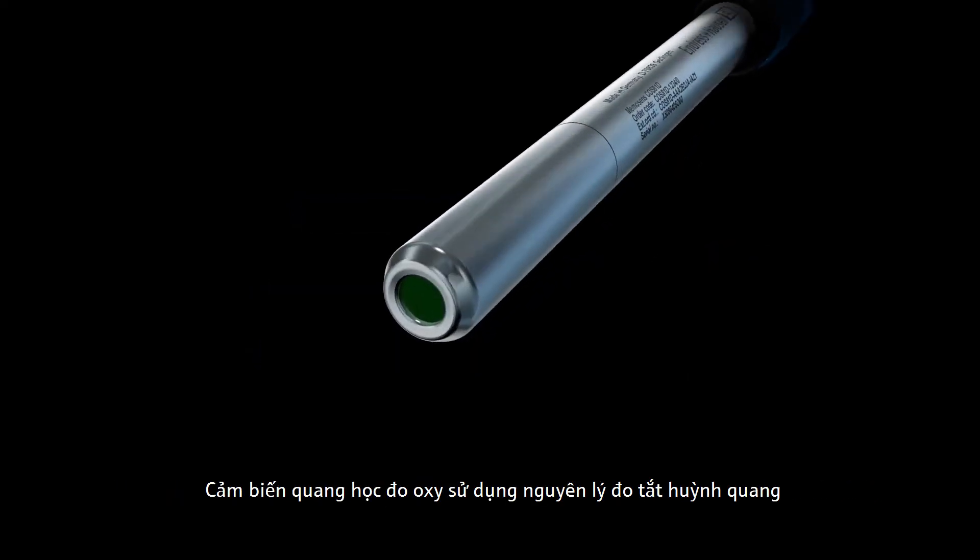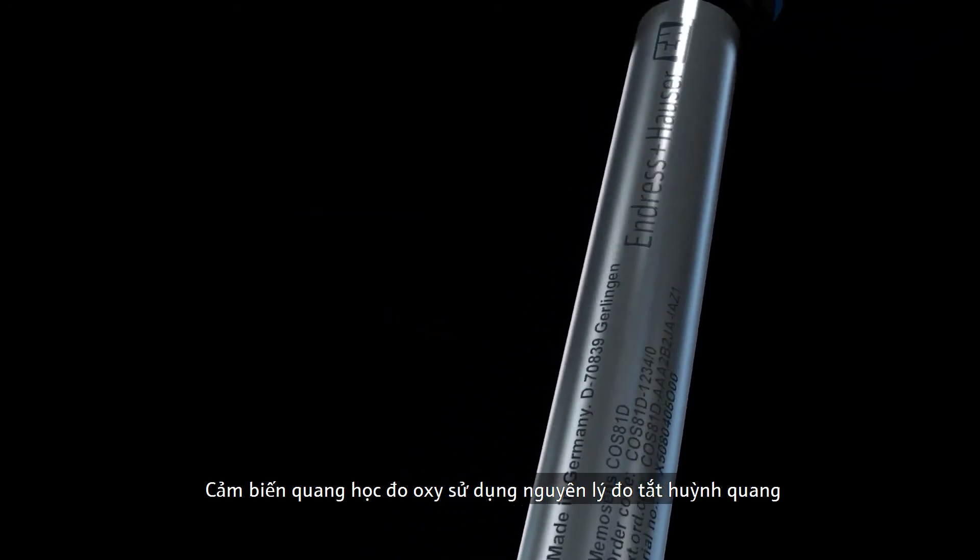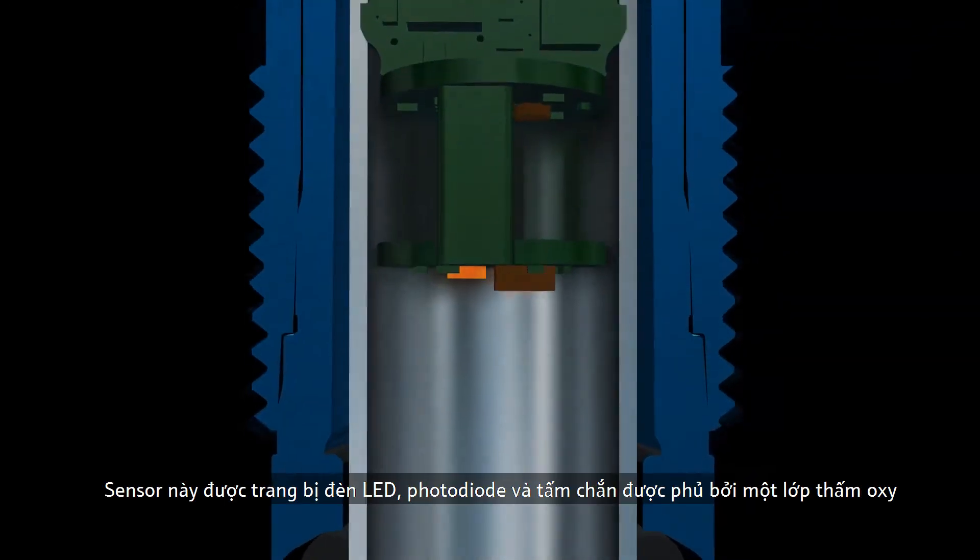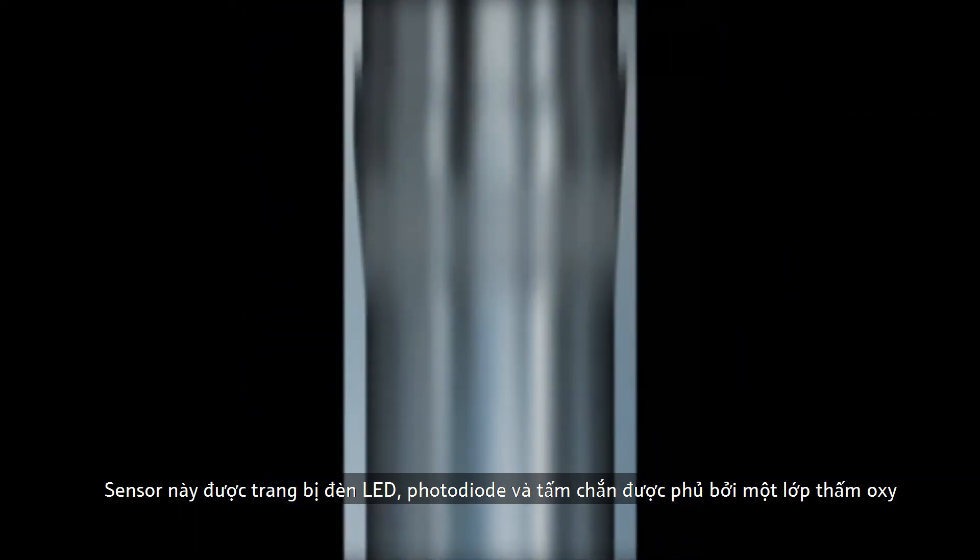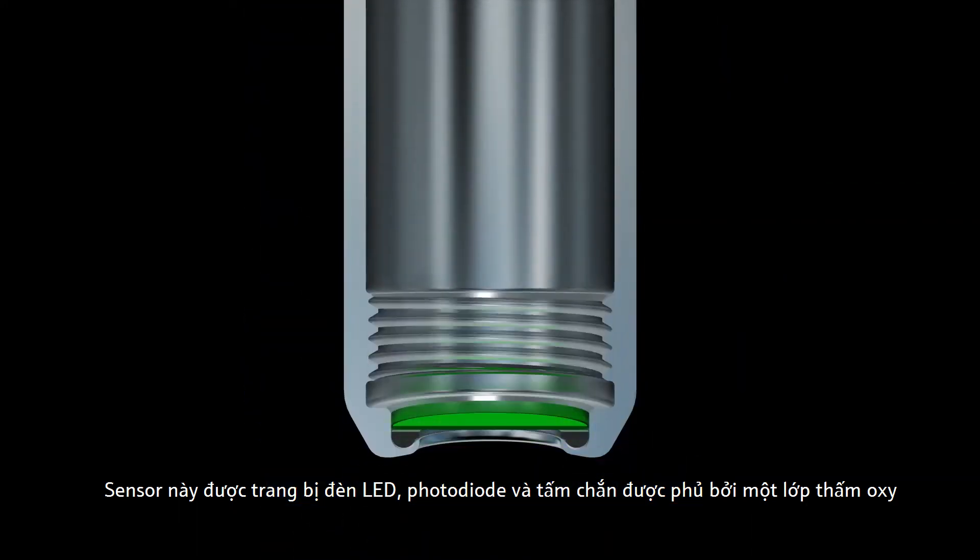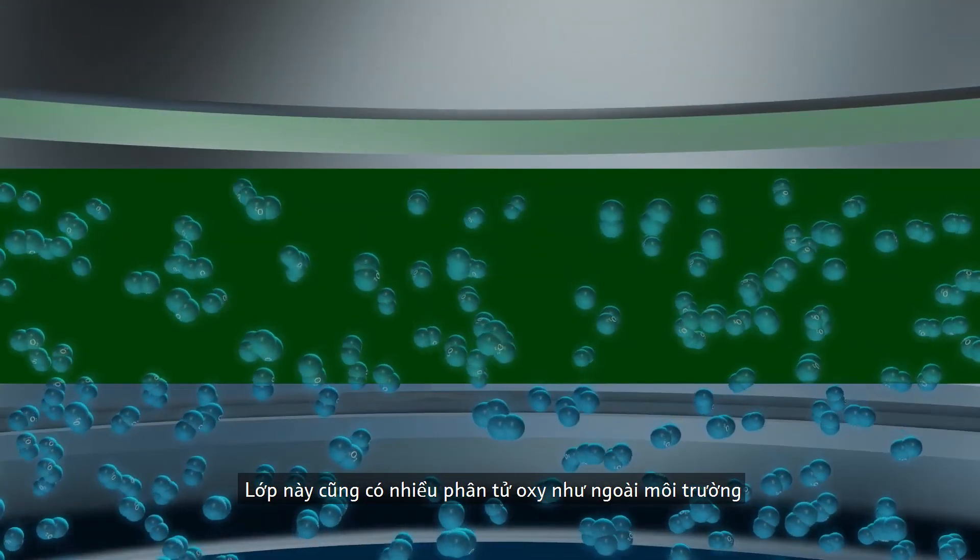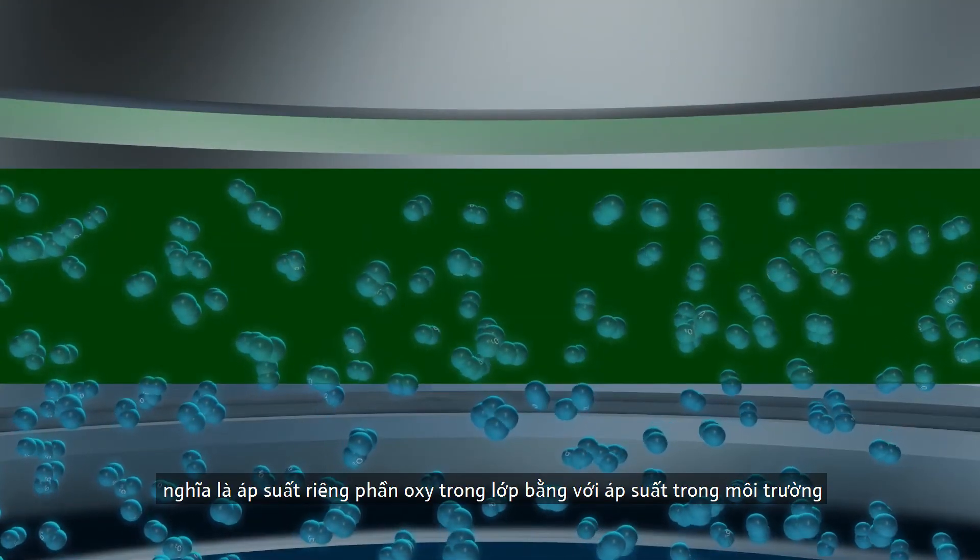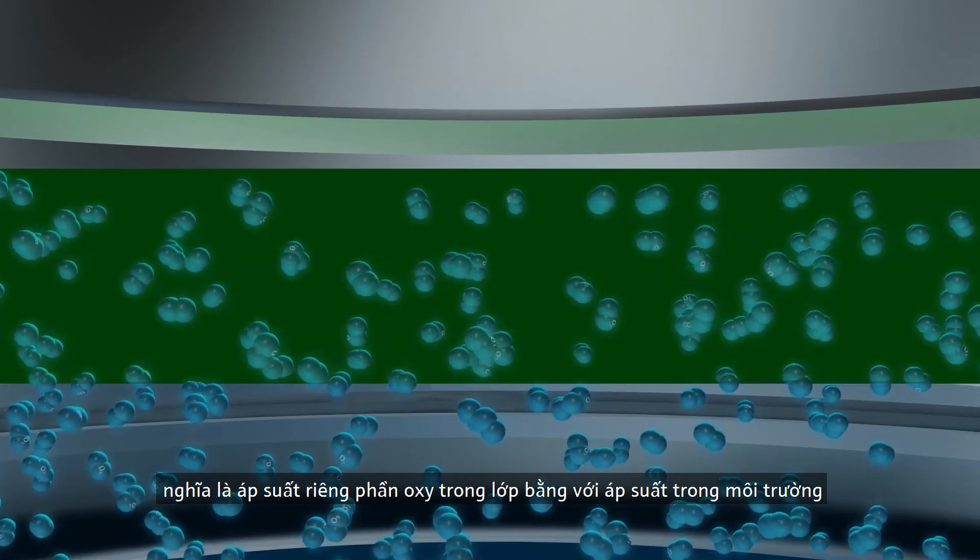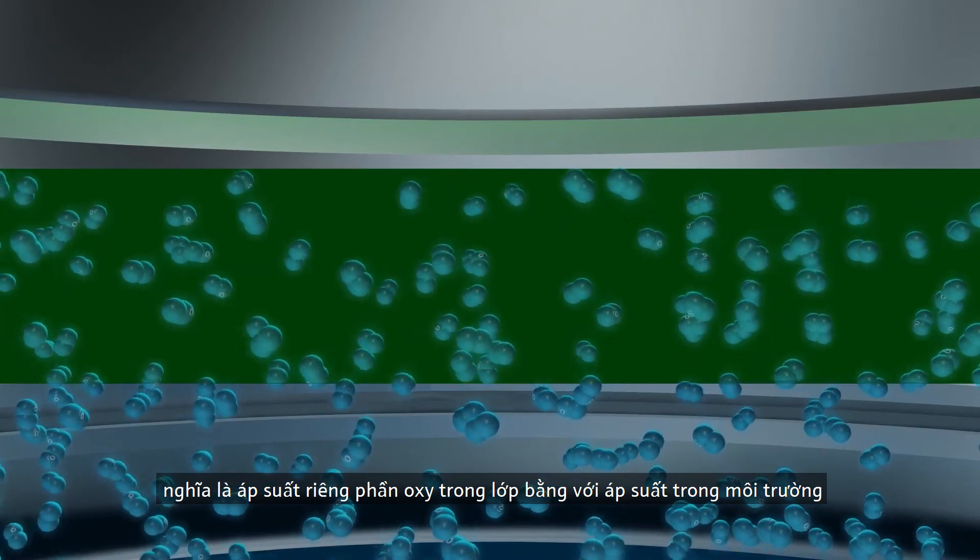The optical oxygen sensor uses the fluorescence quenching measuring principle. This sensor is equipped with an LED, a photodiode, and a separating section that is covered by an oxygen-permeable layer. In this layer there are as many oxygen molecules as in the medium. This means the partial oxygen pressure in the layer is equal to the pressure in the medium.